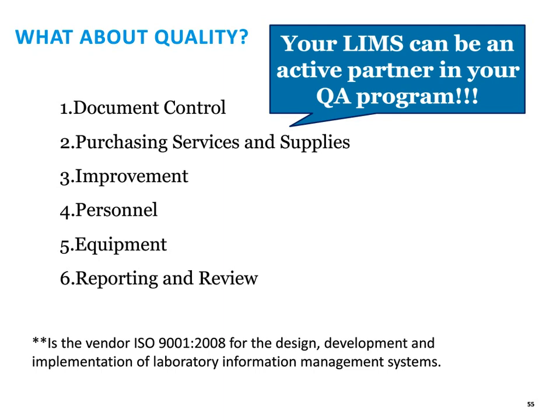That way, with everything linked together, down the road, if we're conducting a quality audit, then we find that there's a case that maybe had a problem we think is related to a certain reagent, then we can simply go look up that lot number of that reagent and see a list of every case, exhibit, and analyses that was used, because the first question the assessor is going to ask is, could other cases have been affected? Think of how much time it would take to do this manually, or if you have a totally separate system, it's just not going to be as efficient.